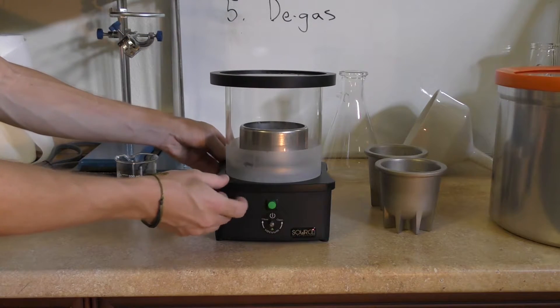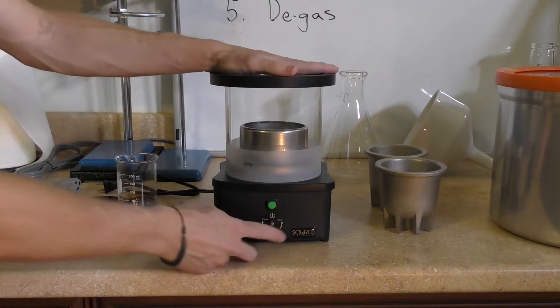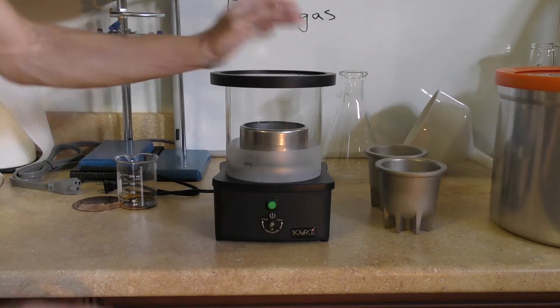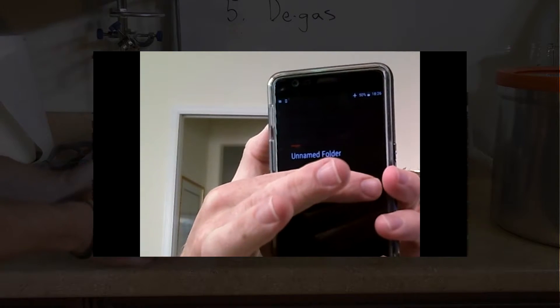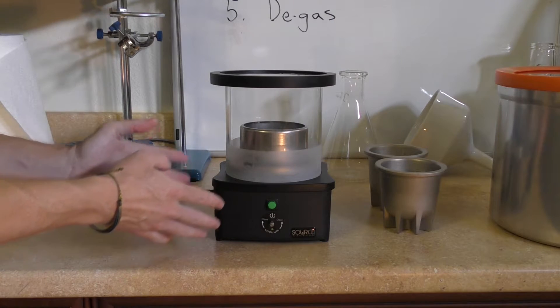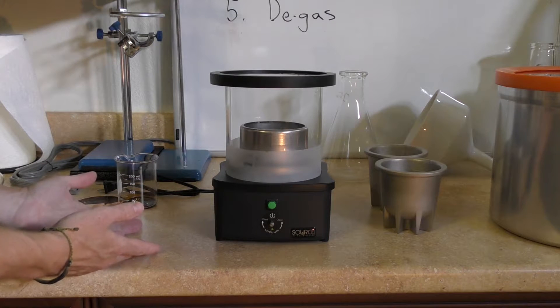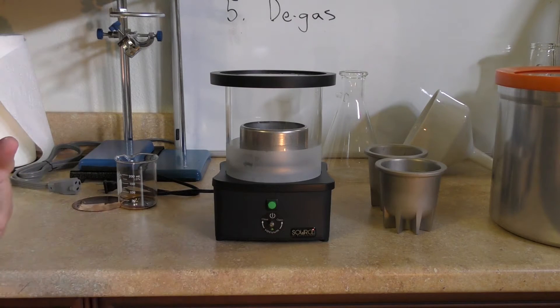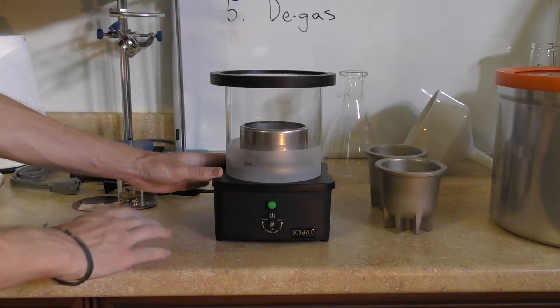Once I had the rubber gasket at the bottom slightly out of place and that wasn't holding the vacuum. Another time I forgot to actually fully close the port. I highly recommend using the app that comes with this device just to make sure you are achieving vacuum. If you don't achieve vacuum, the vacuum pump will just continually start up. It's best to monitor it on the app so you know that the device has achieved sufficient vacuum and you can walk away from it. Otherwise the vacuum will just continuously turn on.